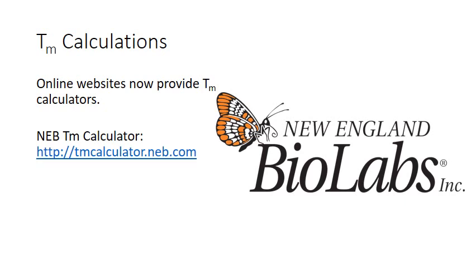Make sure that if you run this TM calculator, you also go back and do it the old-fashioned way with the calculation. Otherwise, you may not get enough of your sample, or you might inadvertently not anneal back that DNA primer, and you might not get anything. So it's something that you have to consider, right? It has to be right. That part has to be right.